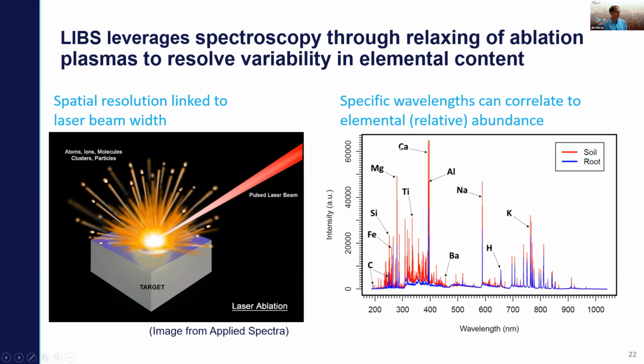You can see, for example, this calcium line is really tall. We're getting a lot of calcium in this case in the soil. You can also see that we're getting a large number of different elements that we can identify in this matter. We've looked at just a few of the ones that we can get. You can make these measurements every time you make that plasma. You can scan through these different wavelengths and really get a collection of information on different elemental nutrients in the soil.